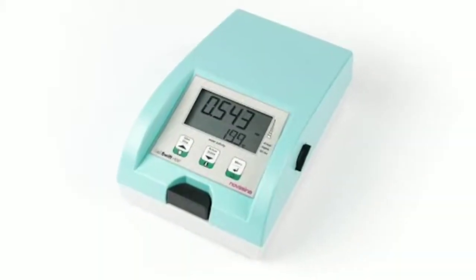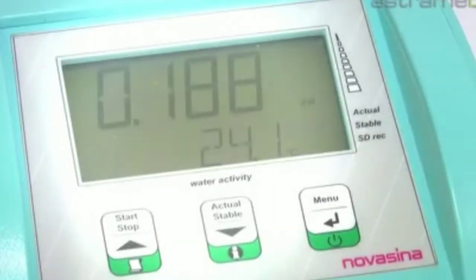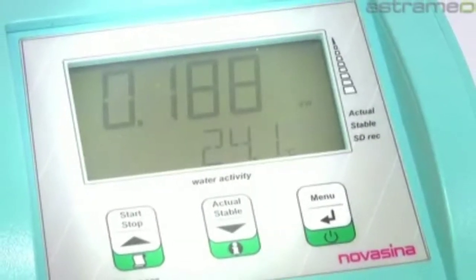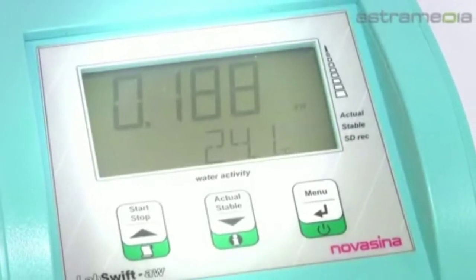With a rechargeable battery as an option, this meter can be placed and used anywhere. It has a reflective, high contrast, large and clear LCD display with dimensions of 35x69 mm, and also 3 multifunction keys including on and off.